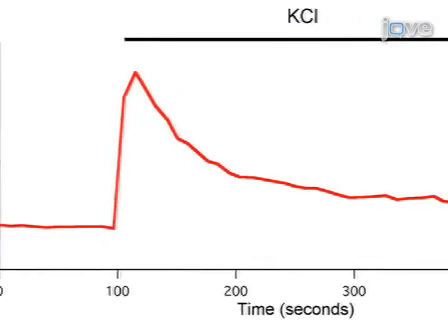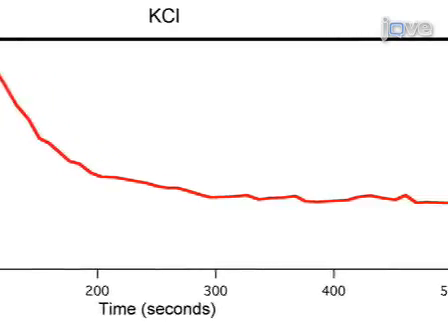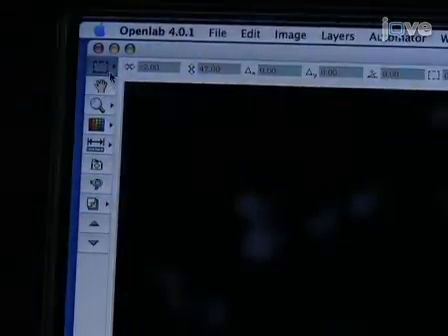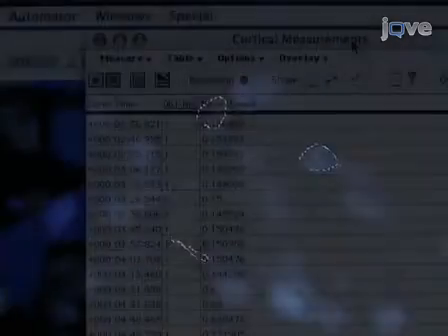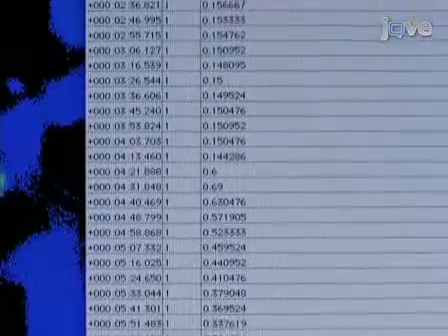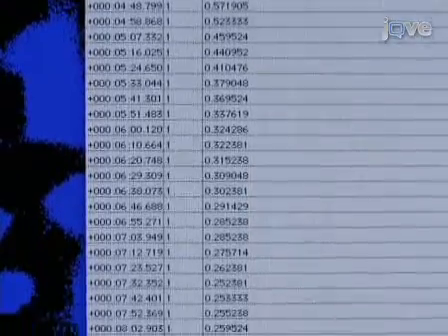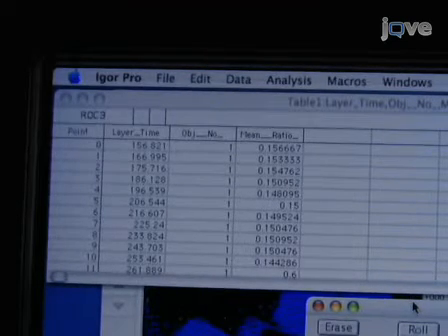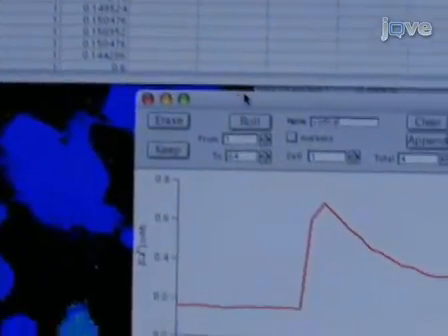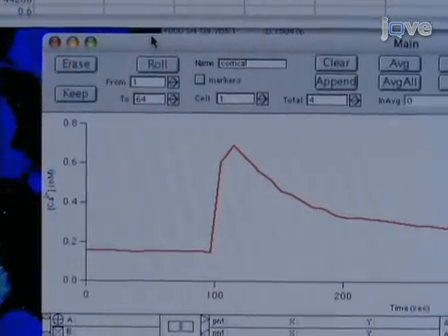To analyze the results, convert the set of ratio images into time-lapse calcium measurements for individual cells or regions of interest within cells. Use the ROI tool to define areas of the ratio image where you want to measure calcium — it is generally useful to have at least one ROI covering the cell body. Then use the software to collect time-lapse ratio measurements for each ROI in each image. Import the ratio measurements into an analysis program such as Igor Pro to convert them into intracellular calcium values. We use a set of macros written in Igor Pro to carry out the analysis.